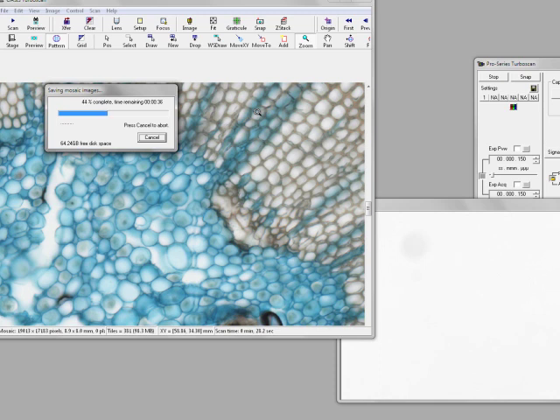So it's quite a big file, as we discussed. It's going to take a couple of seconds to save, probably down to the fault of my hard disk more than anything else, but it's probably taking the same time to save as it does to scan. But this enables me to freely go back to my desk, transfer this file across the network, and then basically just go have a coffee and see how it works. Actually, we'll wait for this to finish, and I'll show you that in a second.